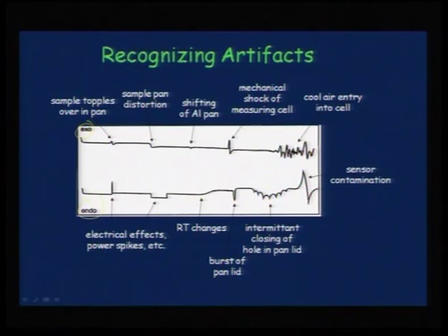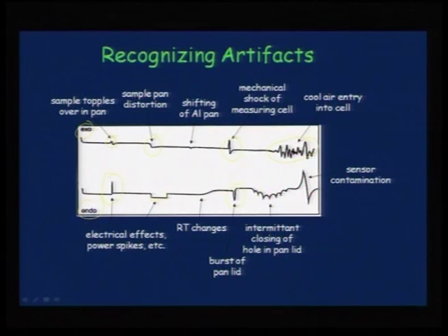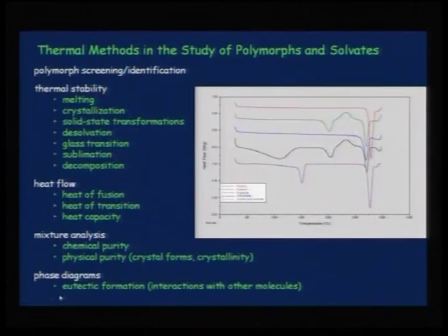Baseline shifts are very mild, so care is needed while analyzing them. Any ups and downs in the DSC curve do not always mean something real is happening — several artifacts can be recognized. In the exo-peak, if the sample topples over in the pan, or the sample pan is distorted, or there is mechanical shock to the measuring cell, or air flow leaks, you see fluctuation noise. In the endo-peak, electrical spikes or pan lid burst can appear as artifacts.